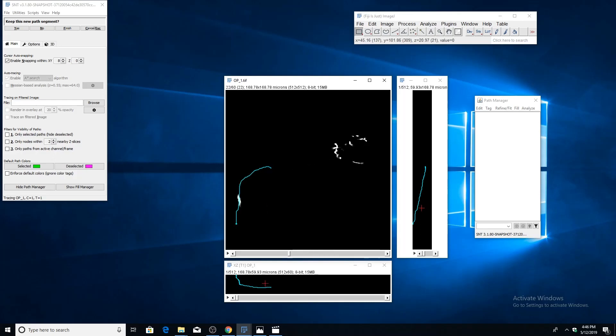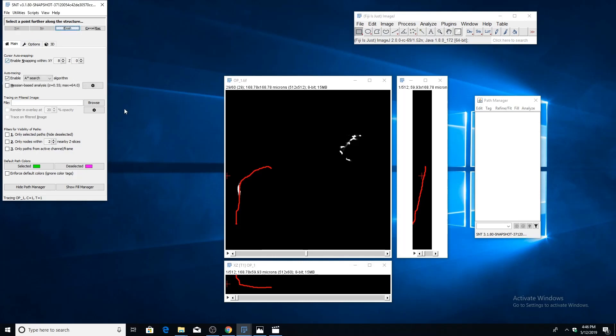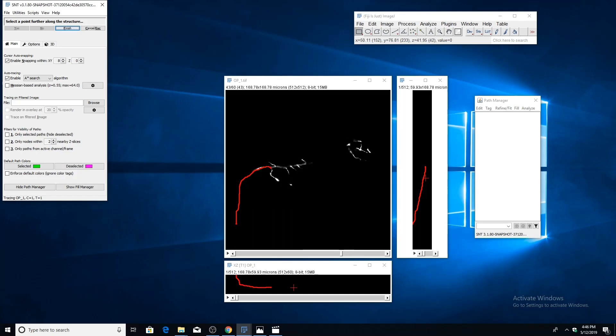I think that path looks correct to me, so I'm going to press Y on the keyboard or yes up here, and that will confirm that temporary segment. We can just continue along in this fashion: just place points, then confirm or deny the temporary segments until you reach an endpoint.